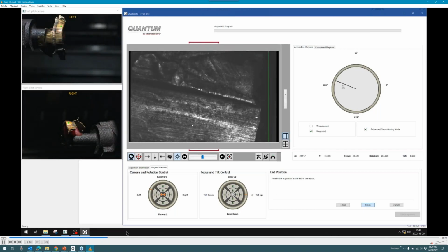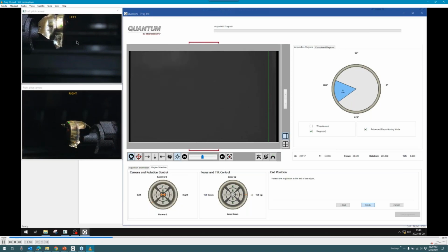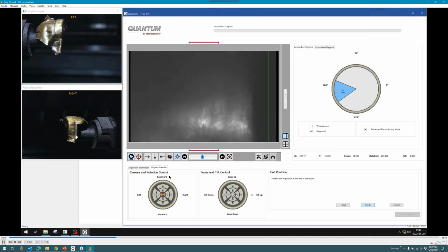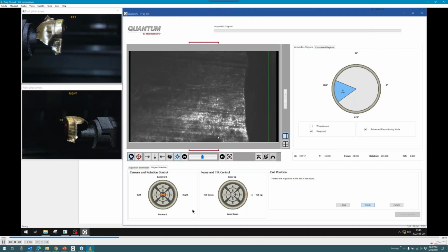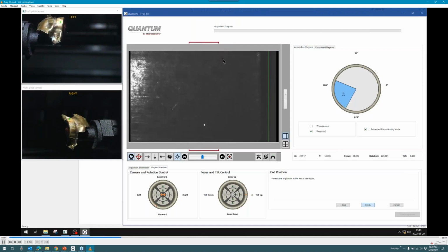I'm going to go and find the end position. The focus goes away very quickly here because of the deformity to it. It doesn't maintain a nice even focus the way you'd expect with a cylindrical shape. So throughout here, we can regain the focus as we need to. That was the end of number 2. Here's the beginning of number 3.